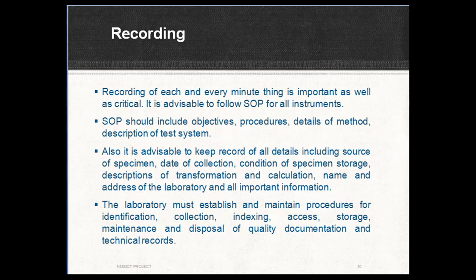Now let's try to understand recording. Recording of each and every minute thing is important as well as critical. It is advisable to follow SOP for all instruments. SOP should include objectives, procedures, details of the methods, and description of test systems. Also, it is advisable to keep a record of all details, including source of specimen, date of collection, conditions of specimen storage, description of the transformation and calculation, name and address of the laboratory, and all important information.